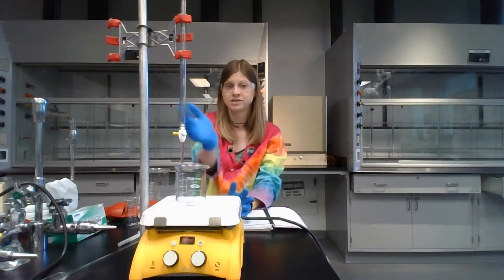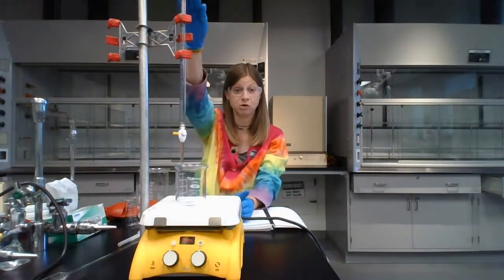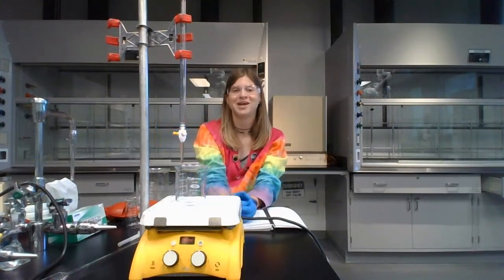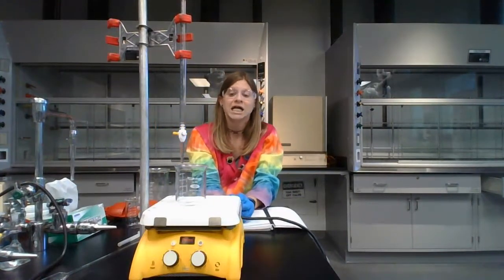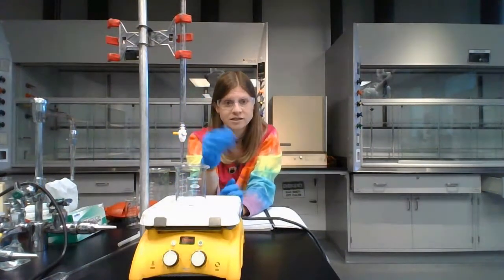And then, just like any other titration, you will record the initial value of potassium permanganate from the burette. You will start adding the potassium permanganate. So what's going to happen at the very beginning? It's the best part of the whole thing. At the very beginning, the solution in the beaker is clear, colorless liquid. The solution in the volumetric flask is dark purple.